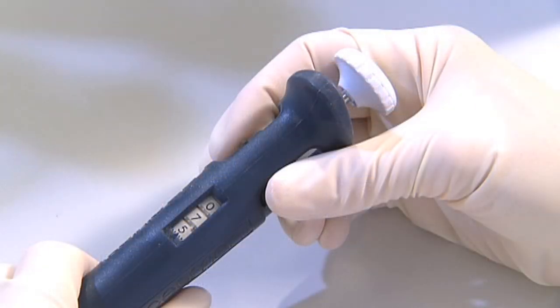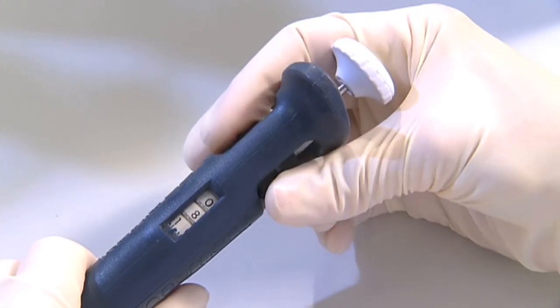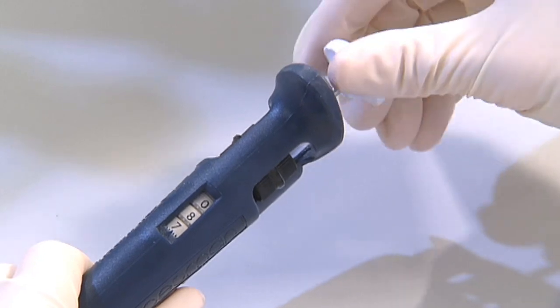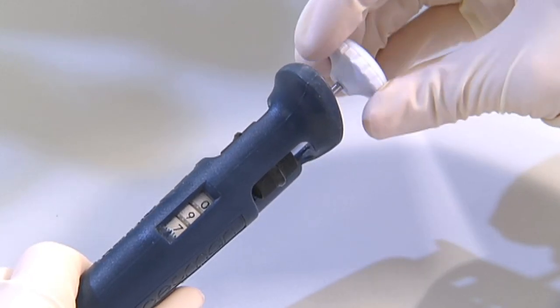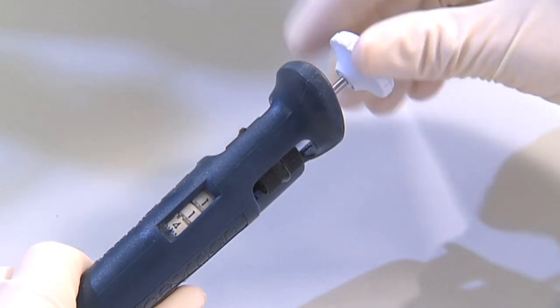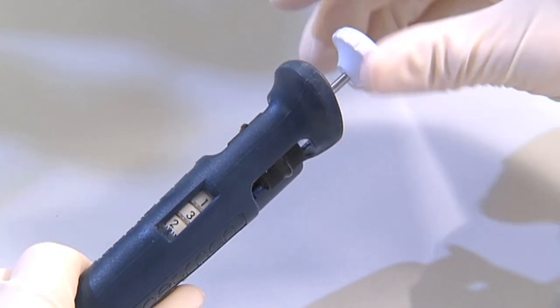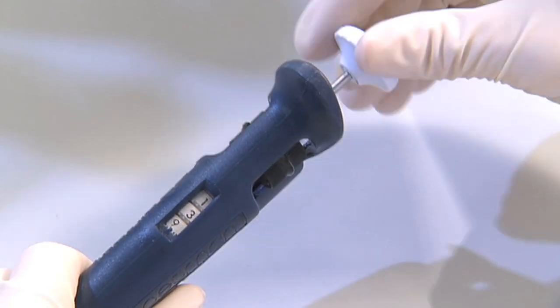Each pipette has a vertical row of three numbers visible in the body of the instrument. To set the volume you can use either the thumb wheel or, on newer models, the push button. This causes the three number dials to rotate and change the volume of liquid that will be taken up. The dial numbers indicate different volumes depending on which pipette is used.